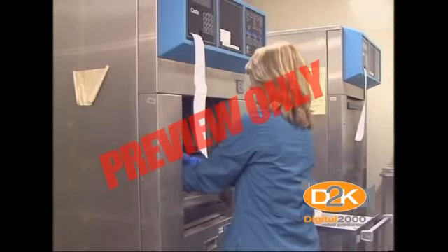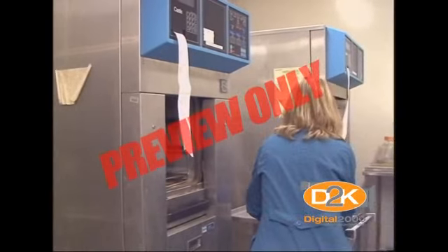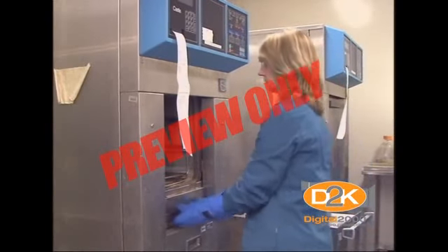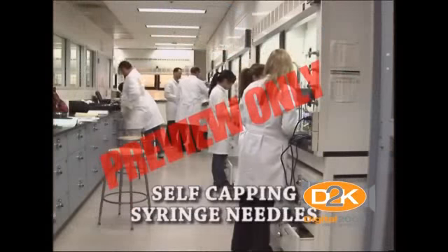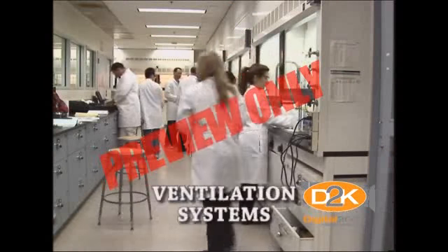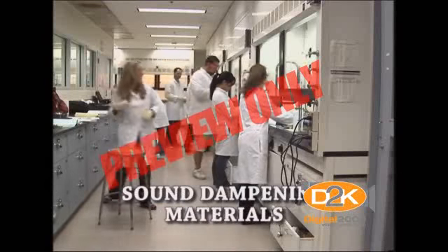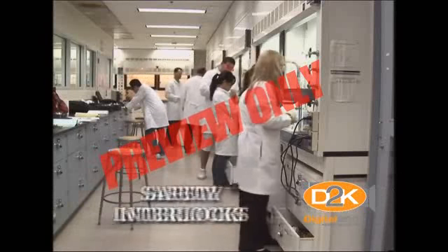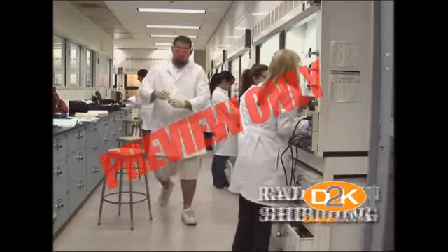Engineering controls are controls that eliminate or reduce exposure to laboratory hazards through the use or substitution of engineered machinery or equipment. Examples may include self-capping syringe needles, ventilation systems such as a chemical fume hood, sound dampening materials to reduce noise levels, safety interlocks in analytical instruments, and radiation shielding.